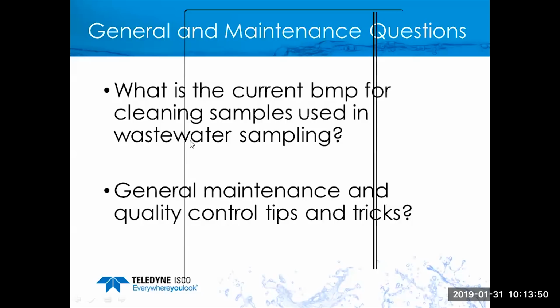There's a question here. Visited an injection well disposal site yesterday. It's class 1 stuff, so we cannot open it to atmosphere as a rule. Everything is closed pipe, and they will create a slip line to drop pressure to something less than 10 psi. How to best plumb the suction line to that steel slip line? Well, there are a variety of ways you could go with that. Certainly a tap of some sort where you have a fitting. Probably you want to have a valve in place so that if there's need to replace tubing, you can shut down and close the line so that you have pressure-free at the sampler to be able to change pump tubing or suction line or whatever.